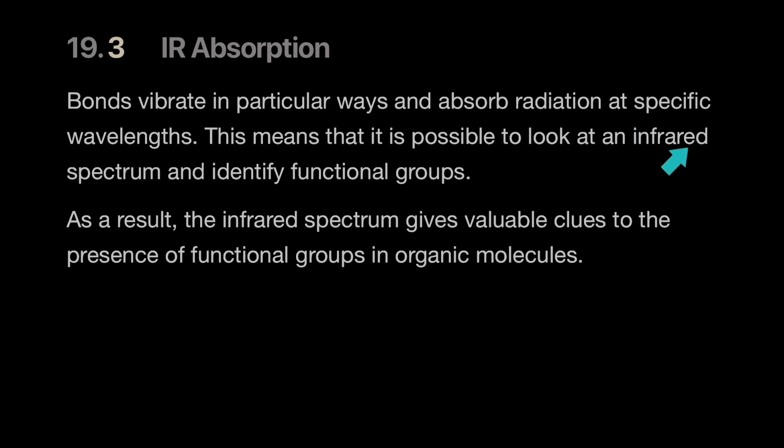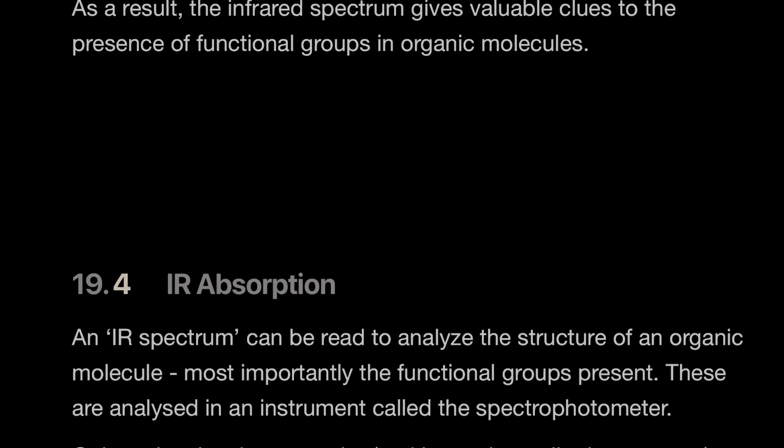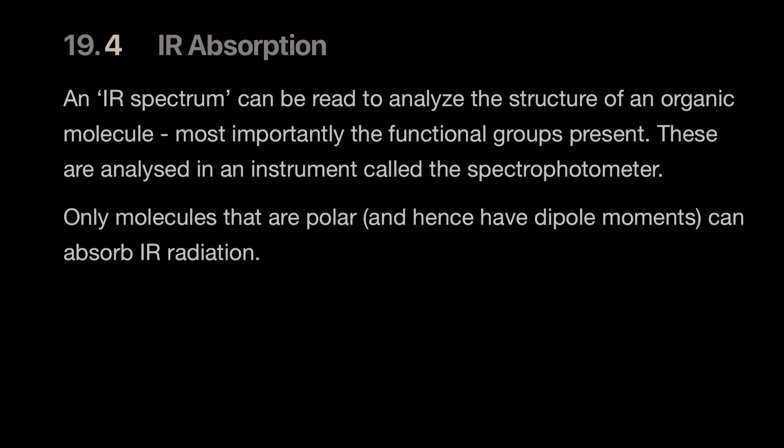And so we can look at the infrared spectrum to identify functional groups. And in the radiation they absorb, a certain frequency will match a certain kind of bond. But what we really need to worry about is an infrared spectrum. An infrared spectrum can be read to analyze the structure of an organic compound.